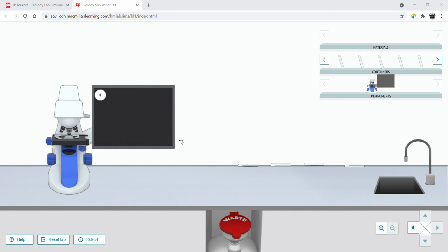You're to label these, and that's what you wind up uploading to your submission link. So we'll go ahead and get started with the virtual lab of this. But this is what you want to label. You want to label figure 1 on your handout.